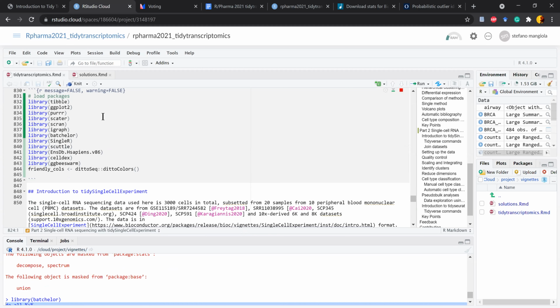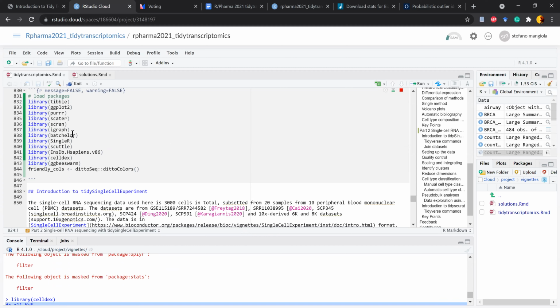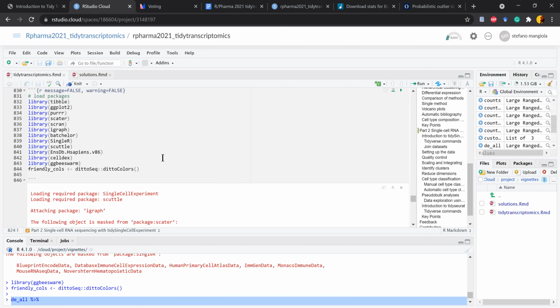Okay, so we start to load all the libraries as before. We use a few of them from the Bioconductor repository. The two bigger analysis frameworks for single cell data are included in Bioconductor, where the community contributes with software, and as well there is Seurat, which is very popular from the Satija Lab, where that is more monolithic. We will show you that as well here.